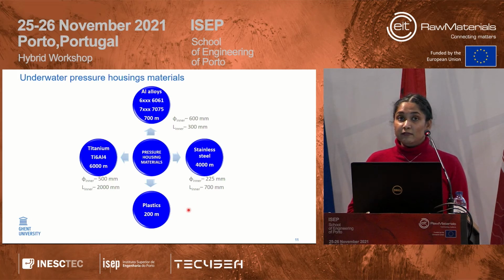So the goal in this project was to aim for a depth of 2,000 meters. Therefore, we tried to do a study based on these three materials, and the potential material would probably be the stainless steel.